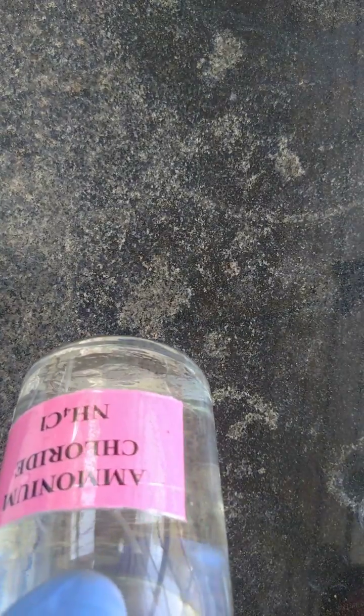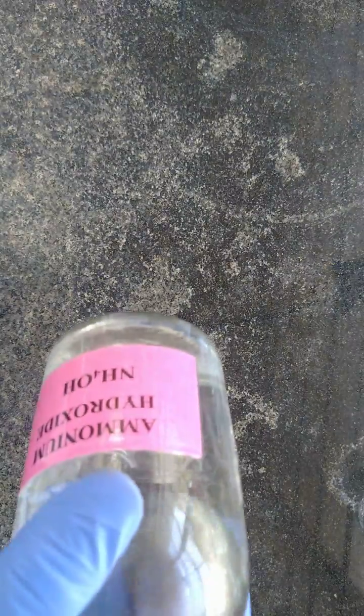The test for group 3 that we are going to perform is, in a test tube we are going to take the original solution which we had prepared initially. I am taking the original solution in a test tube. To this we are going to add ammonium chloride. You can see the label of the reagent bottle. It is ammonium chloride. And to this we are going to add ammonium hydroxide. Add a little bit of excess of ammonium hydroxide.